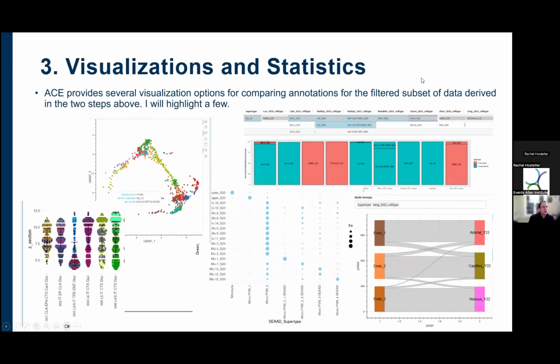And then the final component is that there are several ways of visualizing and exploring the data. I'm going to go through what several of these mean. Here's a gallery of different versions of the data. The one I'm not going to talk about is these bee swarm plots, which are similar to violin plots. It's basically showing the data points, where for a given category you can see how they relate to different numbers.